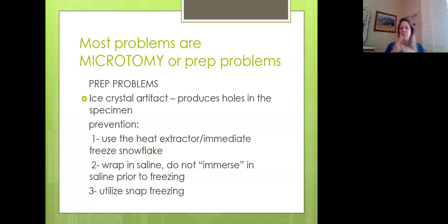In that instance, the pathologist is going to have to determine whether they want a frozen or whether they're going to call into the OR and defer to permanent. That's a common term you're going to hear in frozen sectioning. It's called defer to perm. The defer to perm is two sort of things. It's when the frozen arrives at the histology lab and it's been put in saline, or it's been put in a fixative.